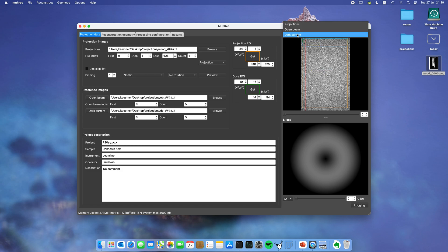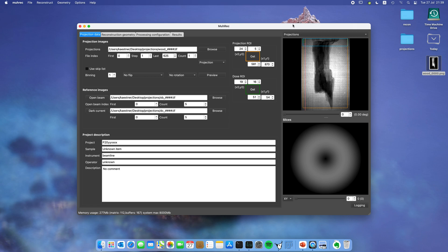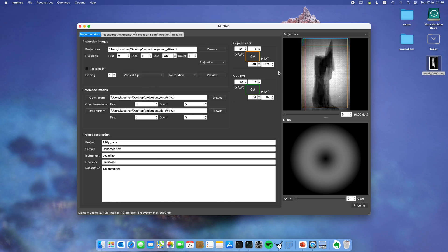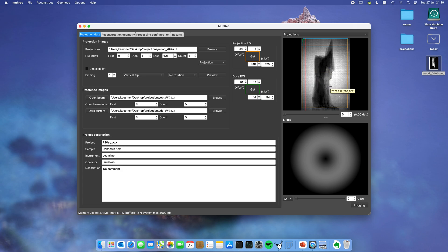Let's go back to the projections. You can see that this sample is standing on its head, so maybe we should flip it. We can go over here and do a vertical flip, and then it stands in the right way. Now we have set everything we need about the data itself, so let's move on to the reconstruction geometry.